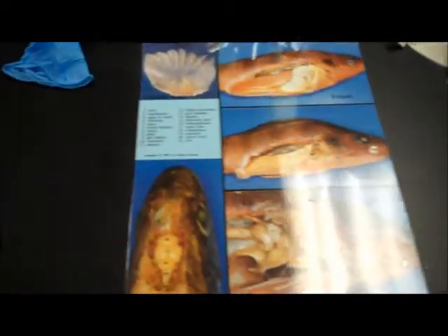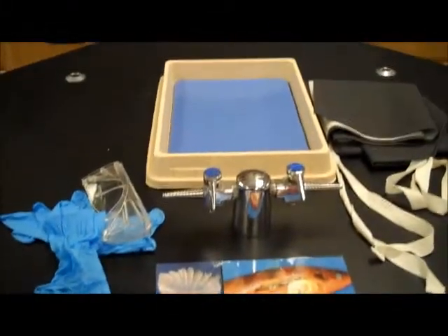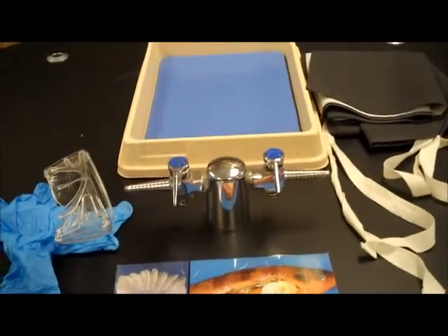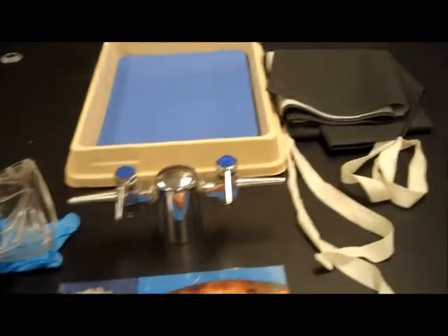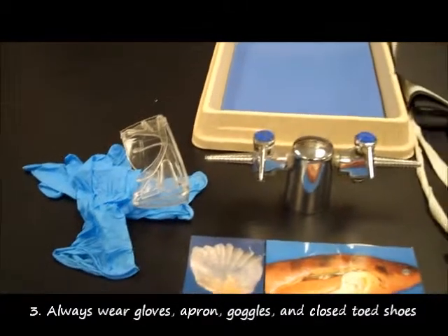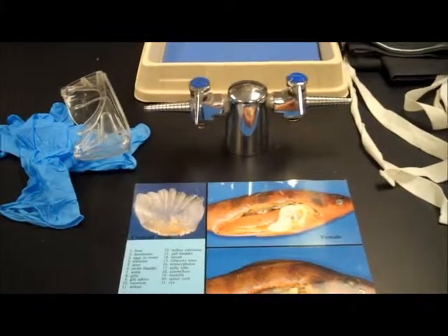So if you cut your glove with forceps, it's important that you get another glove and that you let me know so that I know you're getting another glove. Other safety concerns when you're dissecting, you need to always wear an apron, goggles, and gloves. The goggles and the apron will protect you also from the chemicals that are involved in dissection.